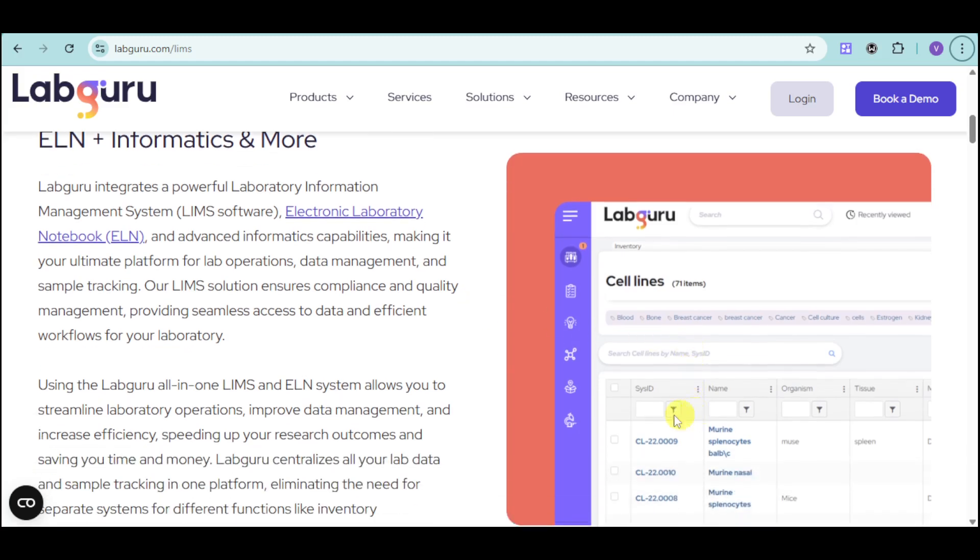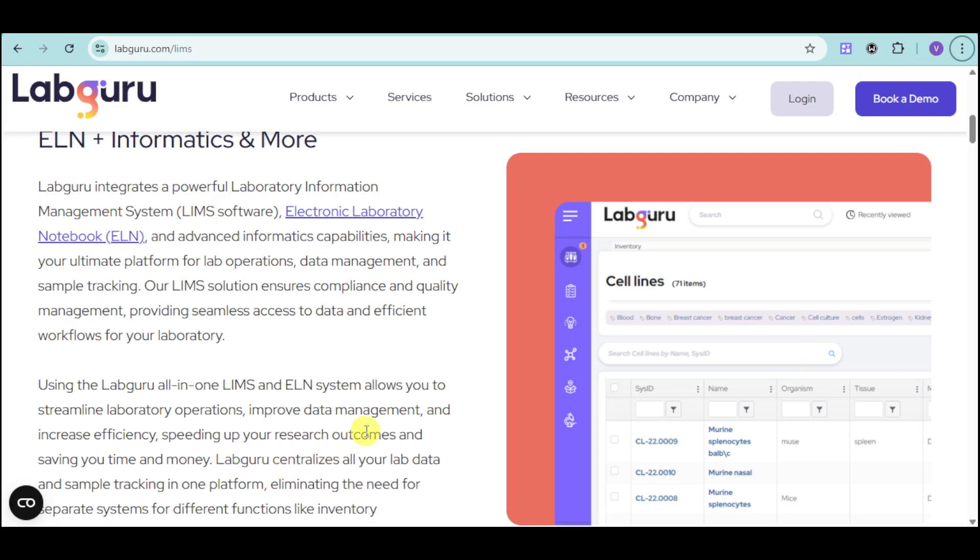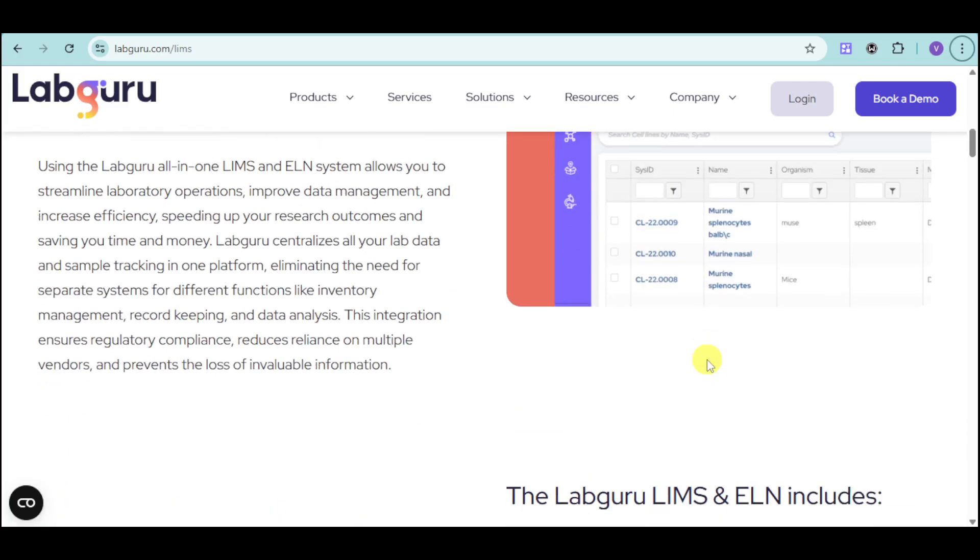We have cell lines, organisms, plasmid, tissue, and the likes. With our actual LIMS, we can create cell lines and sequences. You can use LabGuru's all-in-one system that allows you to streamline your laboratory information and improve your data management. You can also experiment with this one.